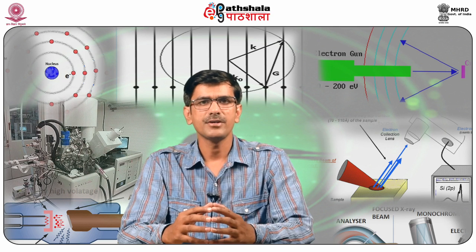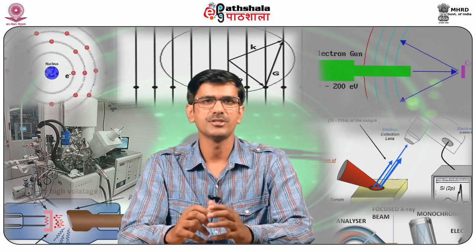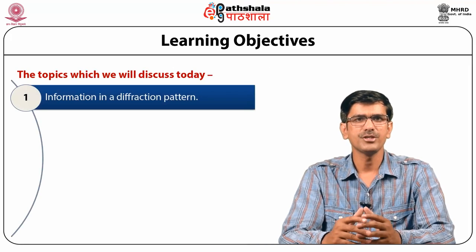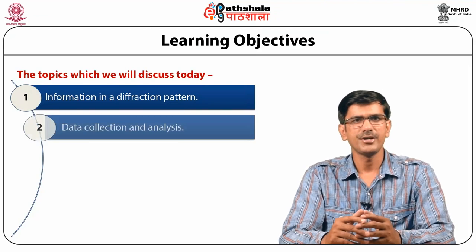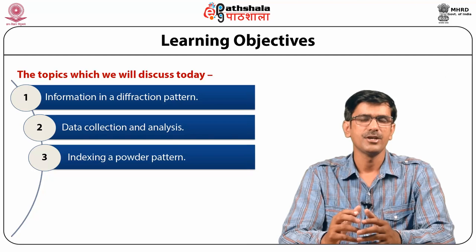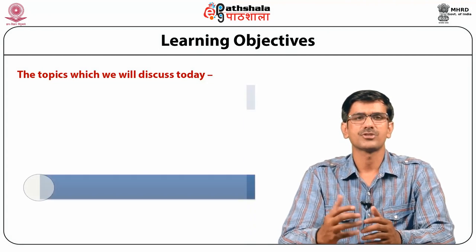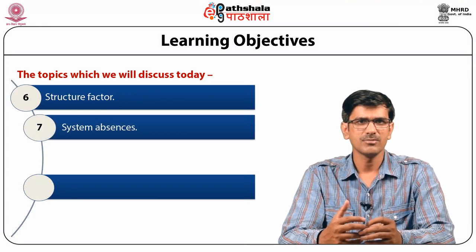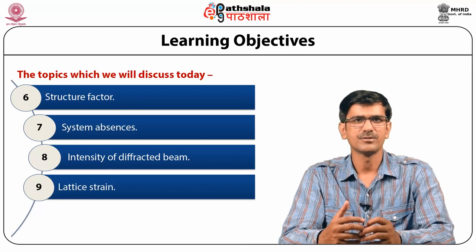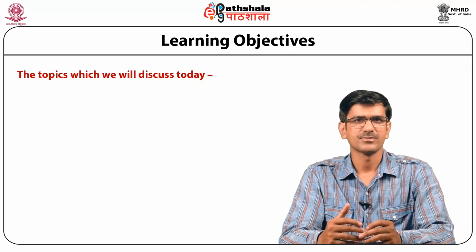X-ray diffraction pattern is the fingerprint of the periodic atomic arrangements in a given material. The topics which we will discuss today: information in a diffraction pattern, data collection and analysis, indexing a powder pattern, initial phasing, reciprocal lattice vector, structure factor, systematic absences, intensity of diffracted beam, and lattice strain. Type of information in XRD analysis.